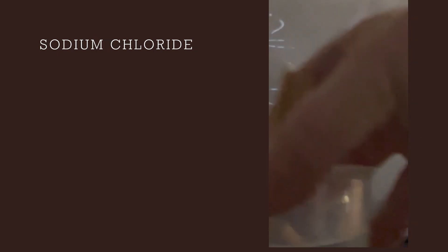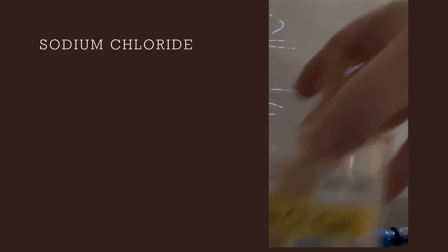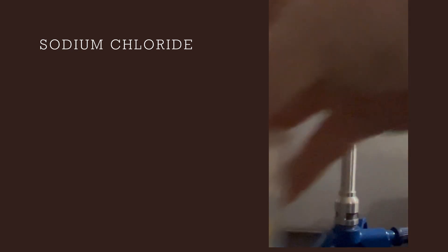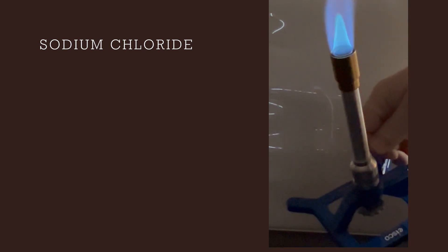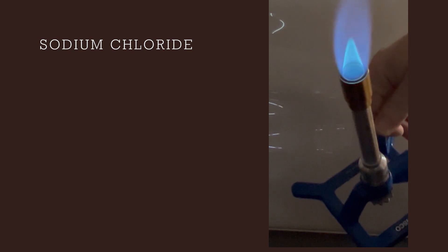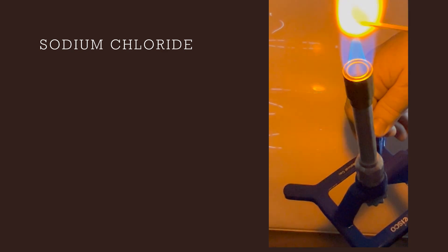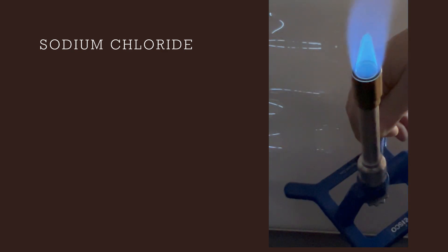Our first one we're going to use for this experiment is NaCl. So I'm going to grab a wood splint. Remember, the hottest part of that flame is the top of that inner core. Notice the wood splint has not lit on fire. So that color was not from the wood splint being on fire.